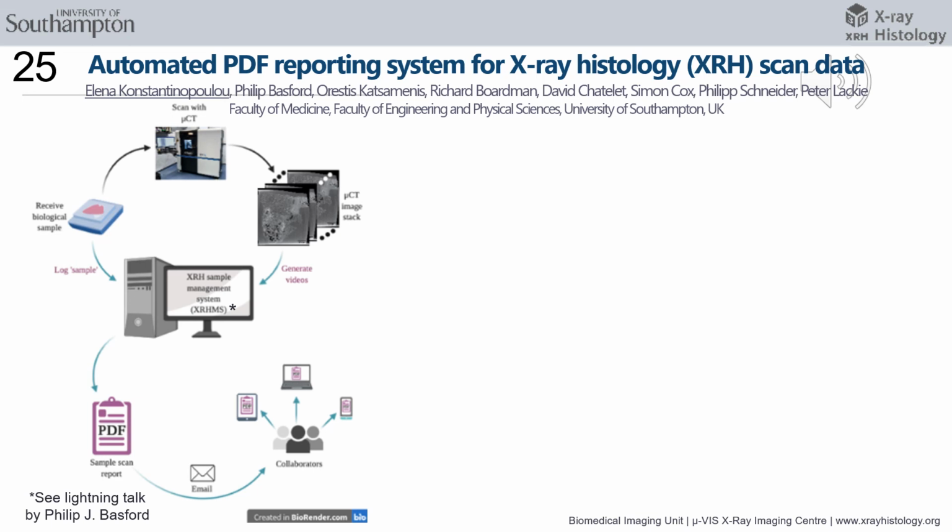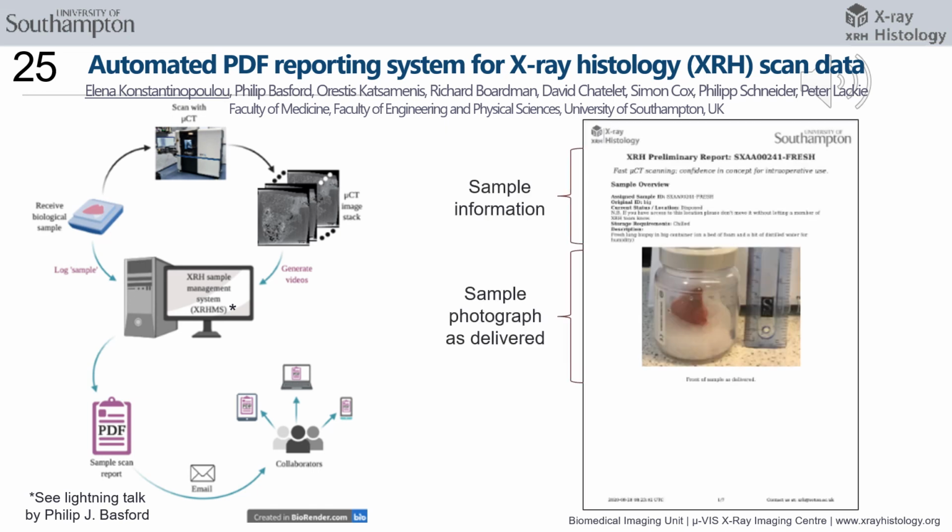This created the need for a data reporting system that assumes no prior user knowledge. For that purpose, we have developed a semi-automated PDF reporting system, which is directly linked with our custom-built XRH sample management system. The PDF format was selected to ensure cross-platform and multi-software compatibility.